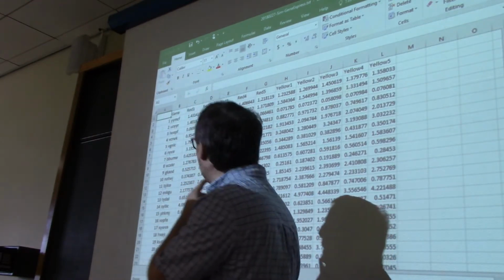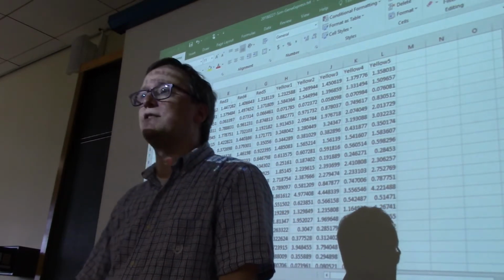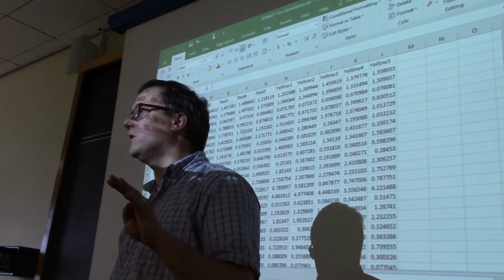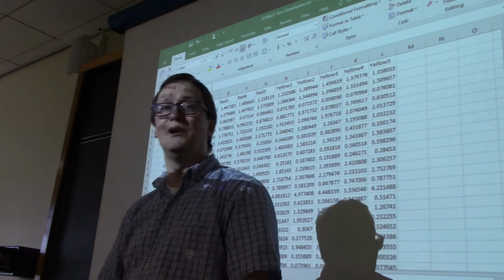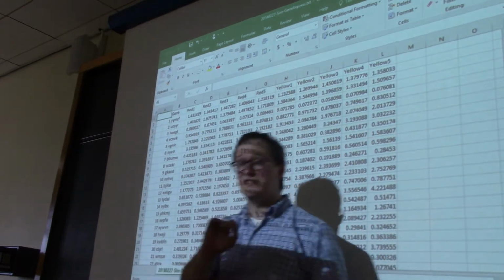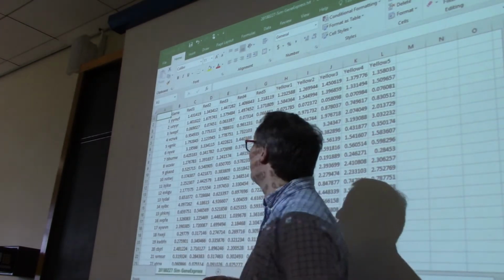I started actually with 4 letters in each gene name. And what I found was that when I simulated 1,000 gene names of length 4, I occasionally ran into collisions. So I decided to go with 5 to avoid that. So, all right, that's neither here nor there. But this is the sort of math puzzle you should probably have in the back of your mind. Comes part and parcel with bioinformatics.